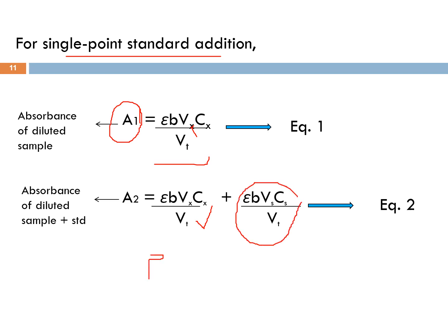Okay, so kalau you nak lagi jelas, ni adalah volumetric flask, ni adalah volumetric flask. Untuk single addition method, kita akan add the same amount of the unknown sample dalam ni, and then di kedua ni kita tambah standard solution yang kita nak carilah.